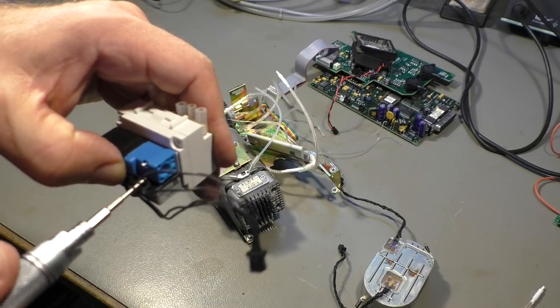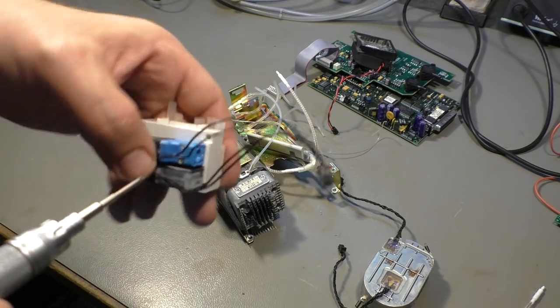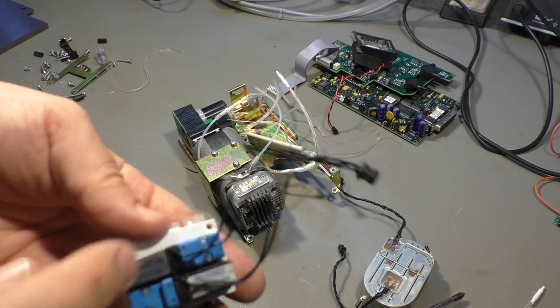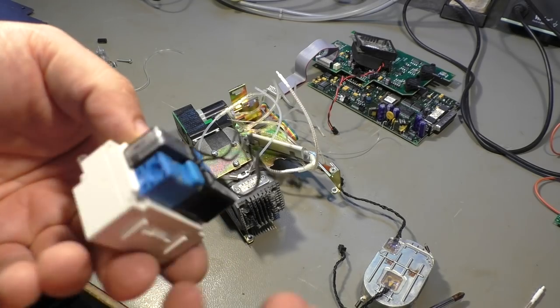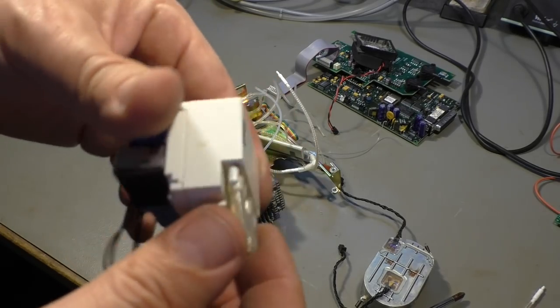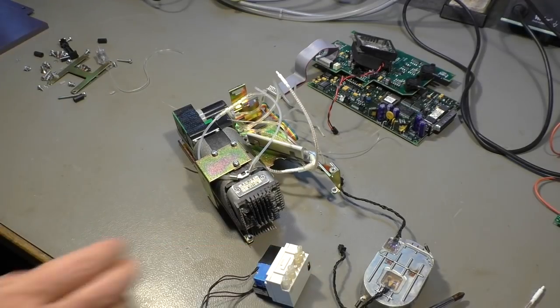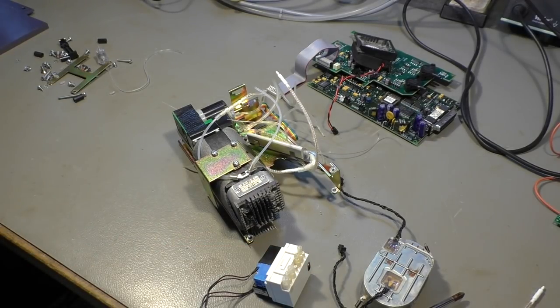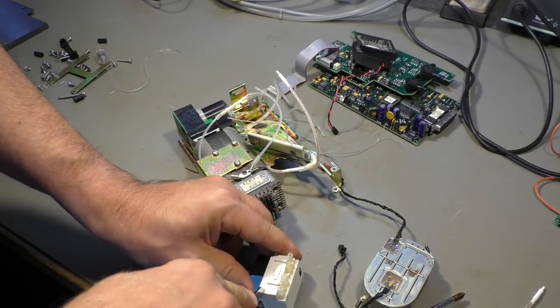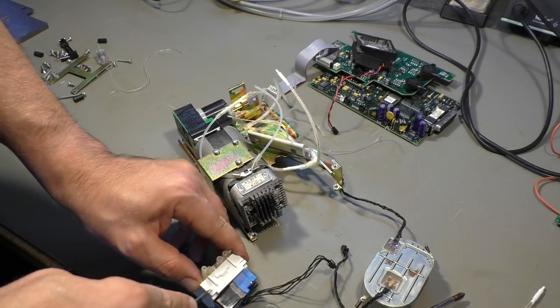I'm a bit disappointed not to see round ports, because that would make it a little bit easier to interface. But on the other side, I have the gasket that fits. So all I have to do is to build a block with three holes and attach some hose nipples. Okay, what's inside? Where is my screwdriver? I don't have one. So I take my knife. Yep, seems to work.